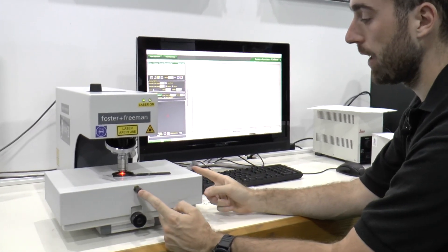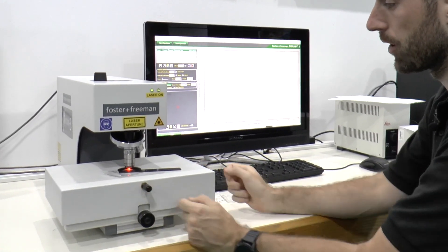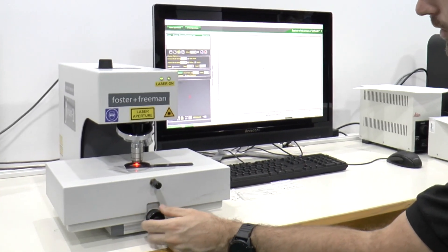Similar to the Echo, we have X and Y controls here so I can move the sample and then the dial here for focusing.